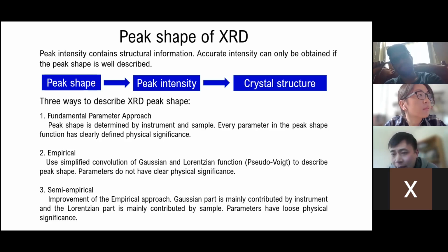And as shown in this slide, currently there are three ways to describe the X-ray peak shapes. Those come from decades of work by a lot of smart people. Generally speaking, we have the fundamental parameter approach.